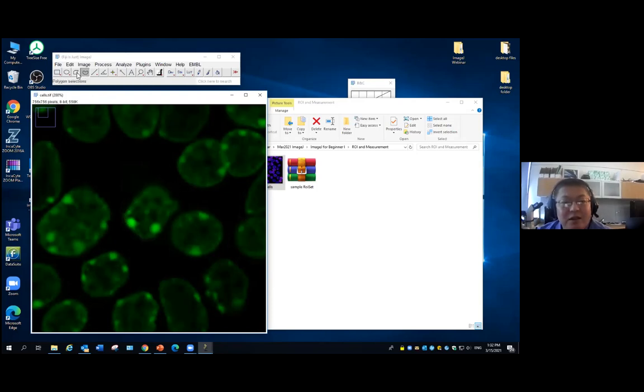Or you can try this one, the polygon. You click on this, you go to the next point, you click on it, and it gives you the polygon. The good thing is that you can have a rest and come back later to keep going. And then this is the selection. So most of the time, if you want to manually draw your objects in the cells, you use either the polygon or the freehand. Like for this time, let's say I want to do the freehand.